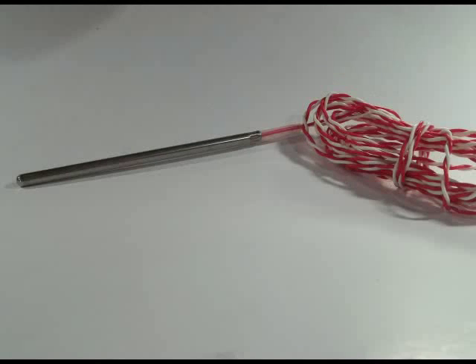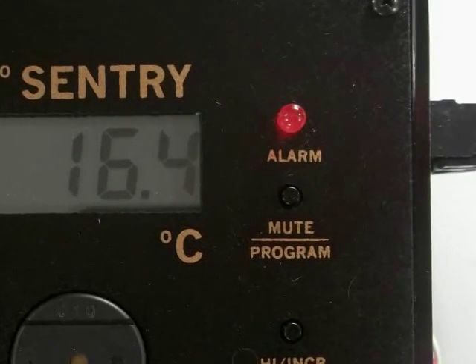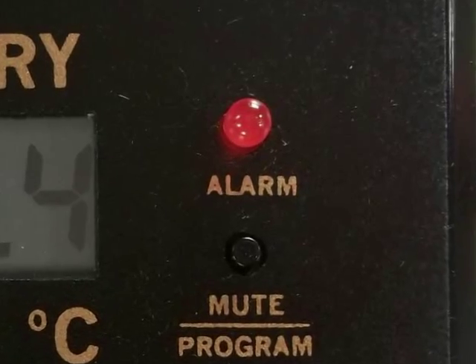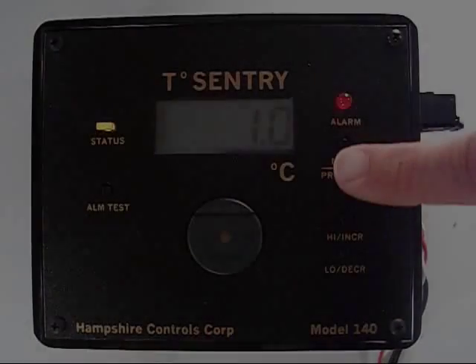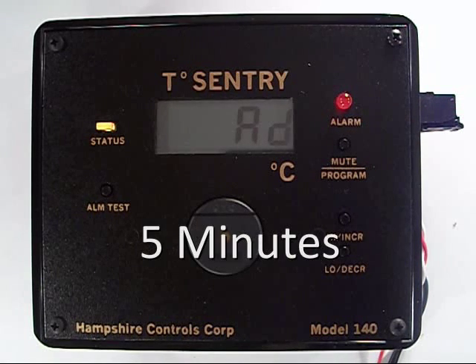Alarm delay. Depending on where you put your probe, there may be reasons for the temperature to rise or fall temporarily. You decide what your alarm delay will be to prevent what we call transient nuisance alarms. One example is if a person opens a door to a refrigerator unit, the temperature may go up for a minute but not be something you want the alarm to sound for. The door closes and everything goes back to normal. You can set this for 0 to 30 minutes. I'm setting this one for 5 minutes.